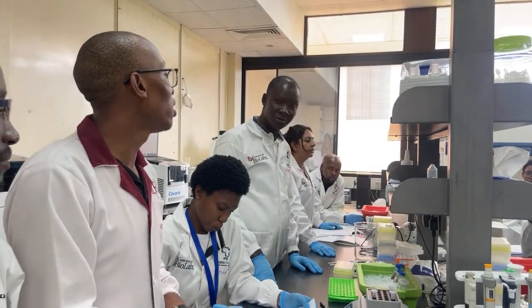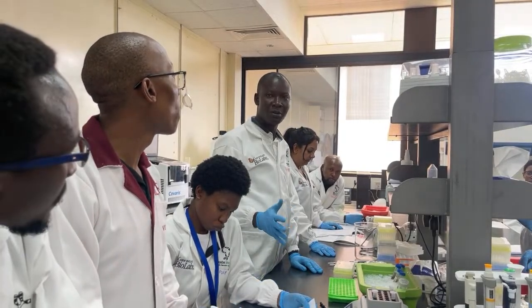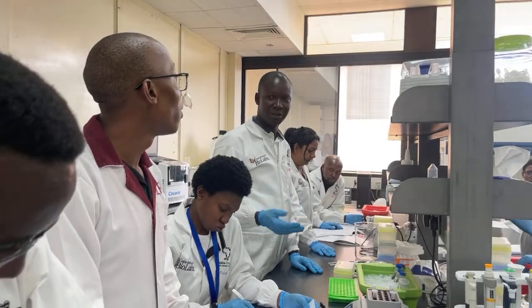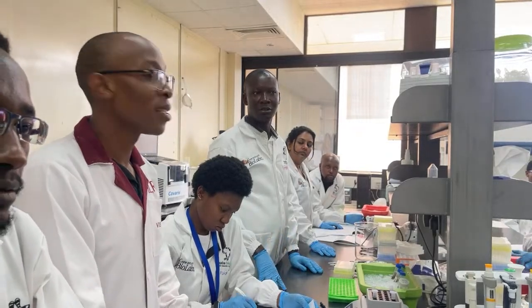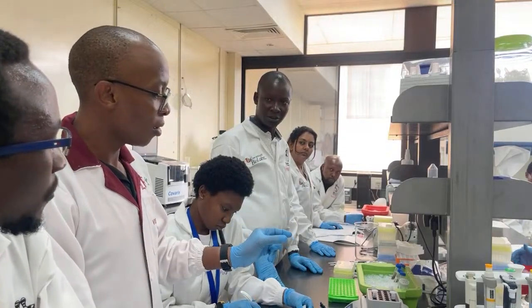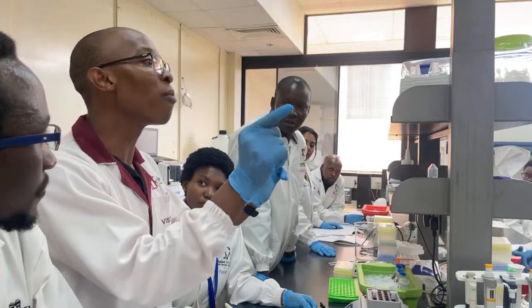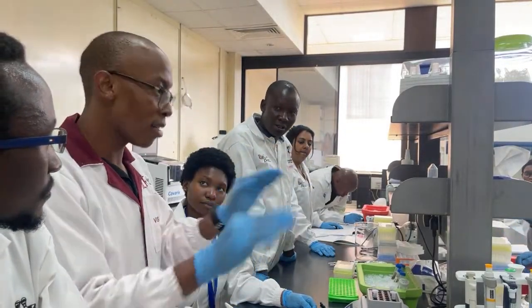So what do you mean by quality check? Like the quality of the bands, with the size of the bands. But it's not specific. That's why you can't rely on it. The only time you can use it is with amplicons, where you want to see, okay, this band is here, so that's the 16S band. That's it.